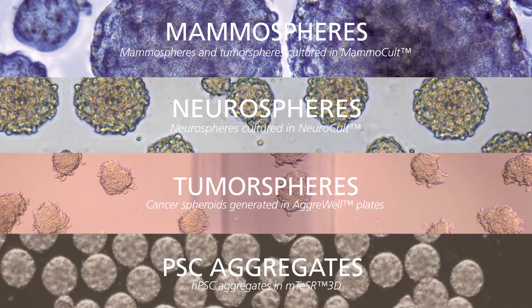Counting 3D spheroid cultures — including mammospheres, neurospheres, or cancer spheroids — can be simple.